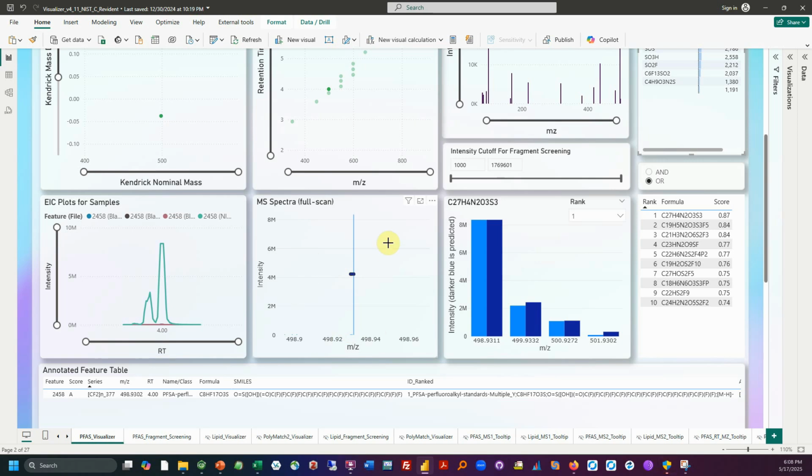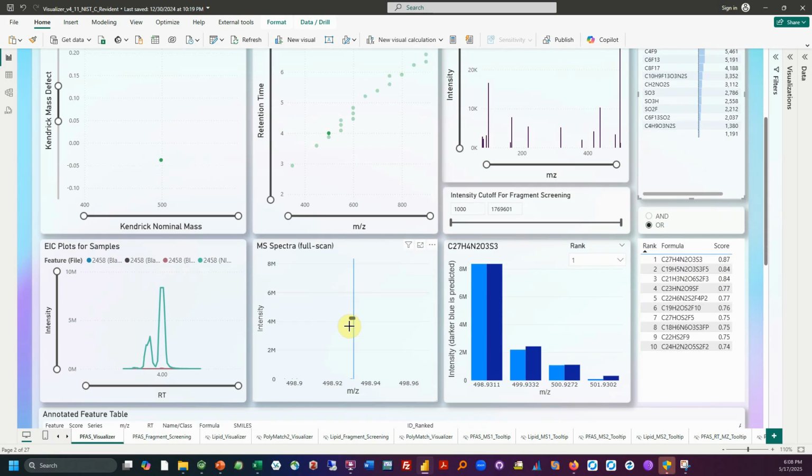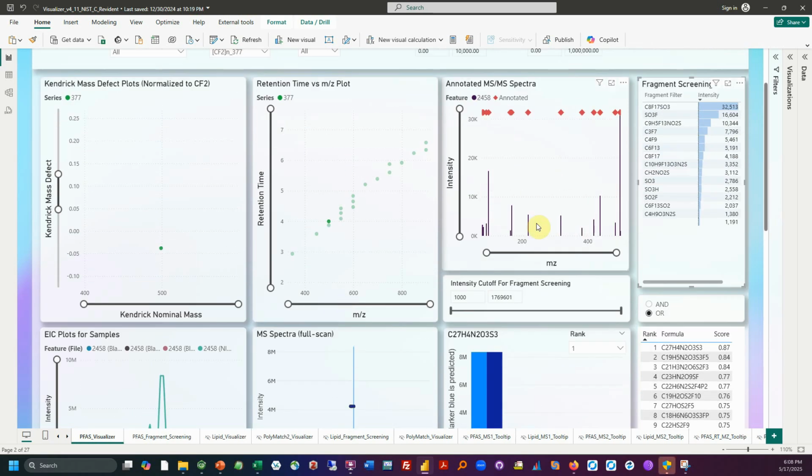If you saw other peaks within plus or minus 0.5 daltons, this would be a mixed MSMS spectra, and some of those peaks that didn't make sense could come from another molecule. Still, there could be another isomer at the same time as PFOS that has nitrogens, for example. We don't know. But I would be very confident with these species, especially given that it correlates nicely in this homologous series, that it is a PFAS and did get a score of A, and I would be confident in the species. I'm just going in great detail so you can think how each fragment may or may not make sense. As you get more familiar with the software, with fragmentation, as you get familiar with mass spectrum and PFAS mass spectrum specifically, this step will become faster and faster.